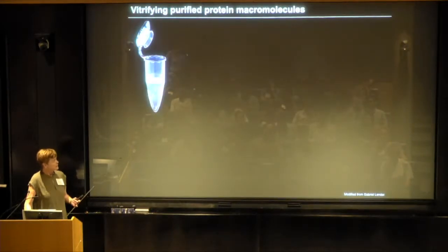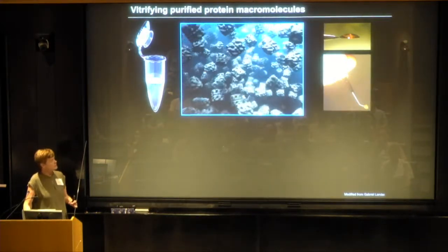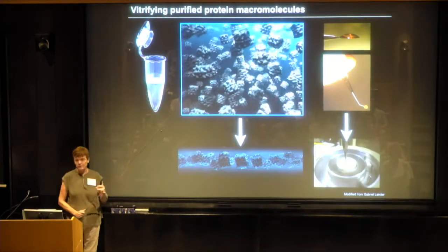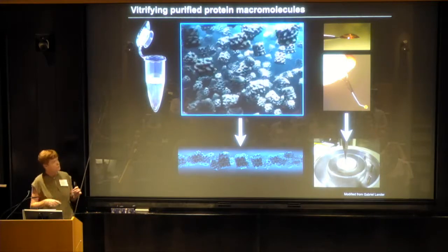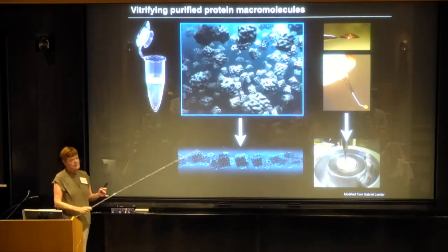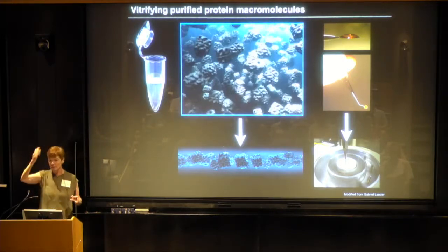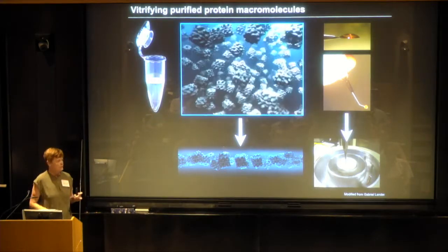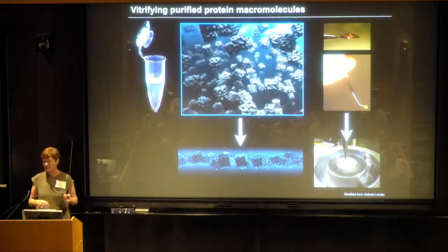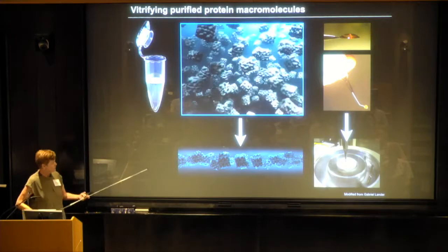But anyway, I'll do a very dumbed down version, much more dumbed down than Joachim's fancy manifolds. How we think about cryo-EM is that you have single particles that have already been purified out of the cell. You put a little solution of this onto the grid. You reduce that to a thin film and slam it into a really good cryogen. You heard Fred asking Joachim, what's the temperature change during this process? We kind of believe it happens very, very rapidly, so it snaps from the liquid to the solid state, and we have all these little conformations trapped just as they were. That's probably not correct, but it's almost correct.